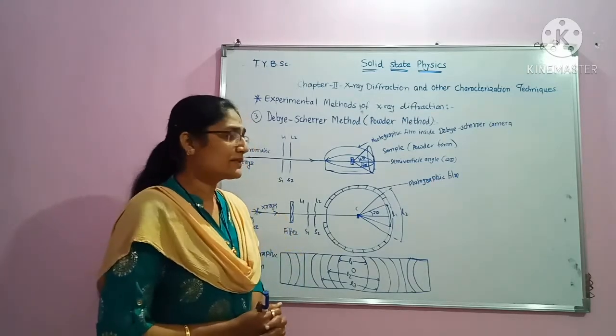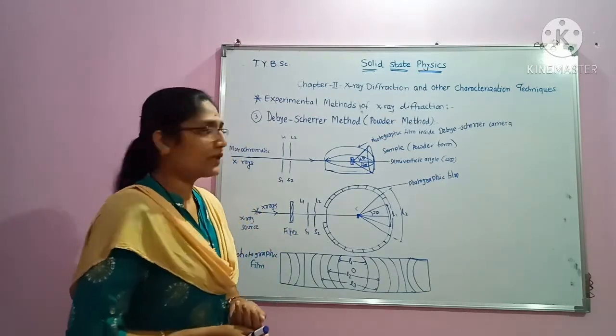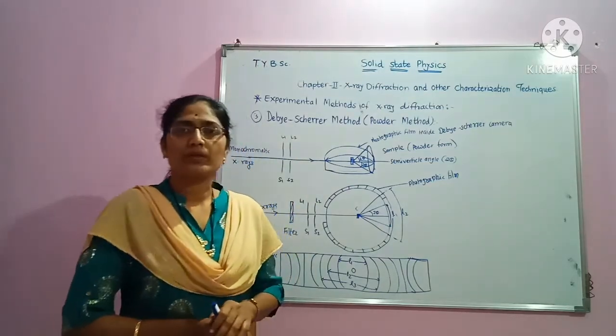Hence it is necessary to devise one more device or equipment which can study the material which is in powder form.